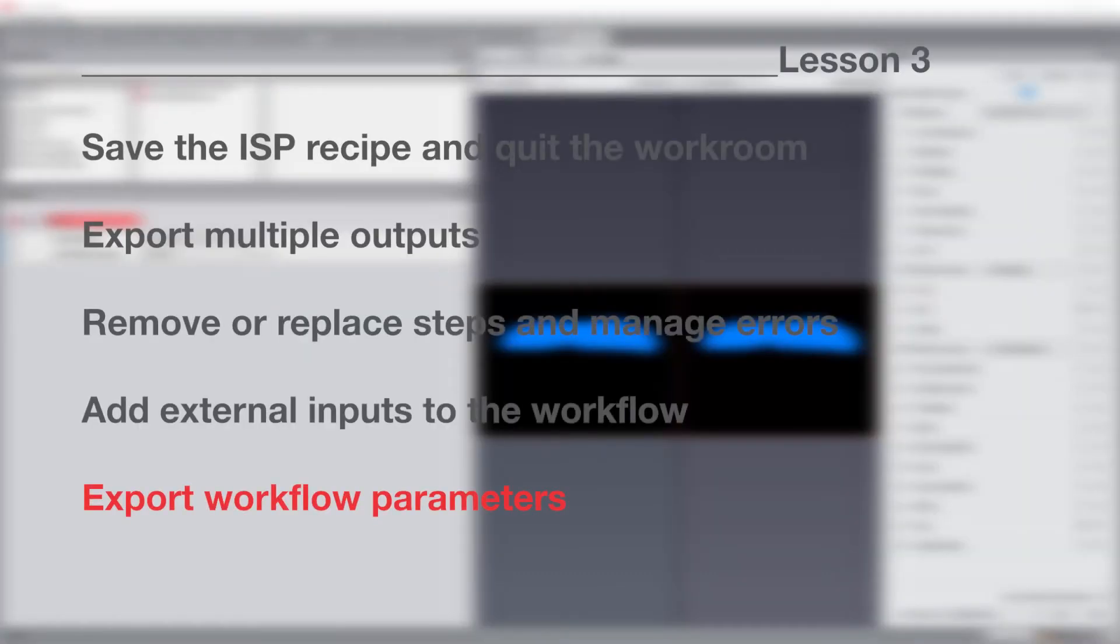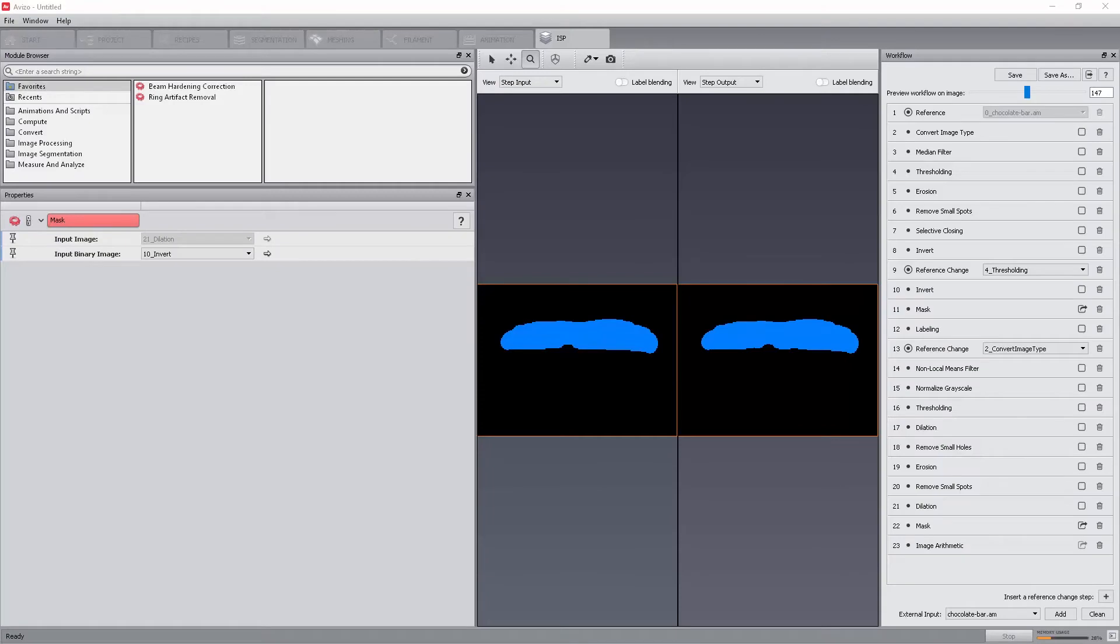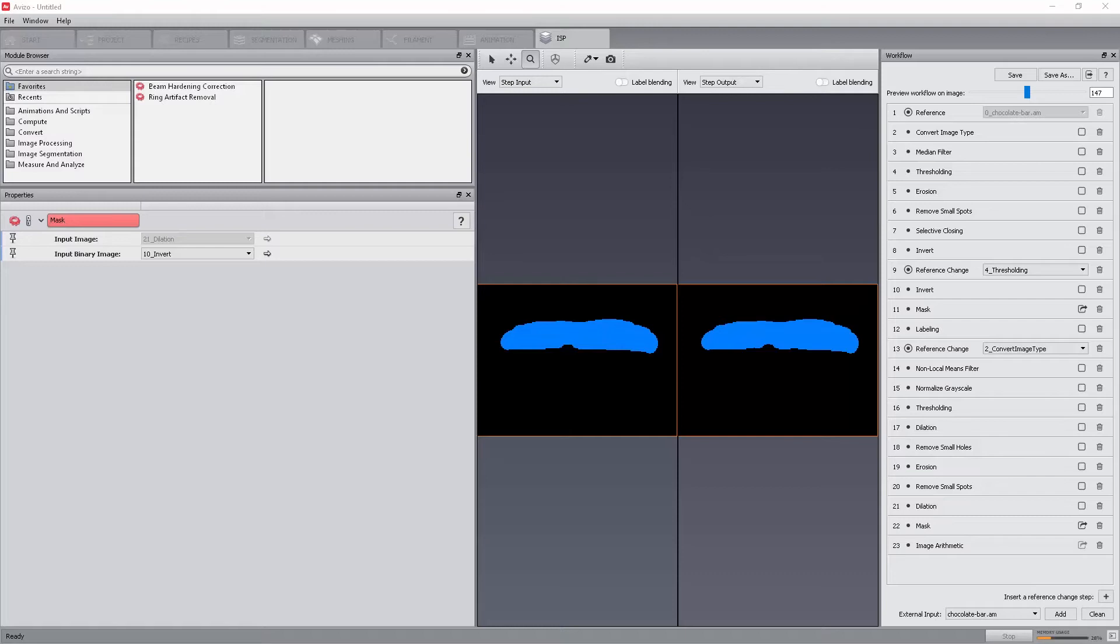We will now select and export specific parameters from the image stack processing workroom to make them available from the image stack processing module in the project workroom. Since the image stack processing recipe can be used on any input data from the project workroom using the image stack processing module, it is sometimes convenient to have specific parameters of the workflow readily available directly from the module. We can then fine-tune the recipe when applied on a dataset different from the one which is used to create it.